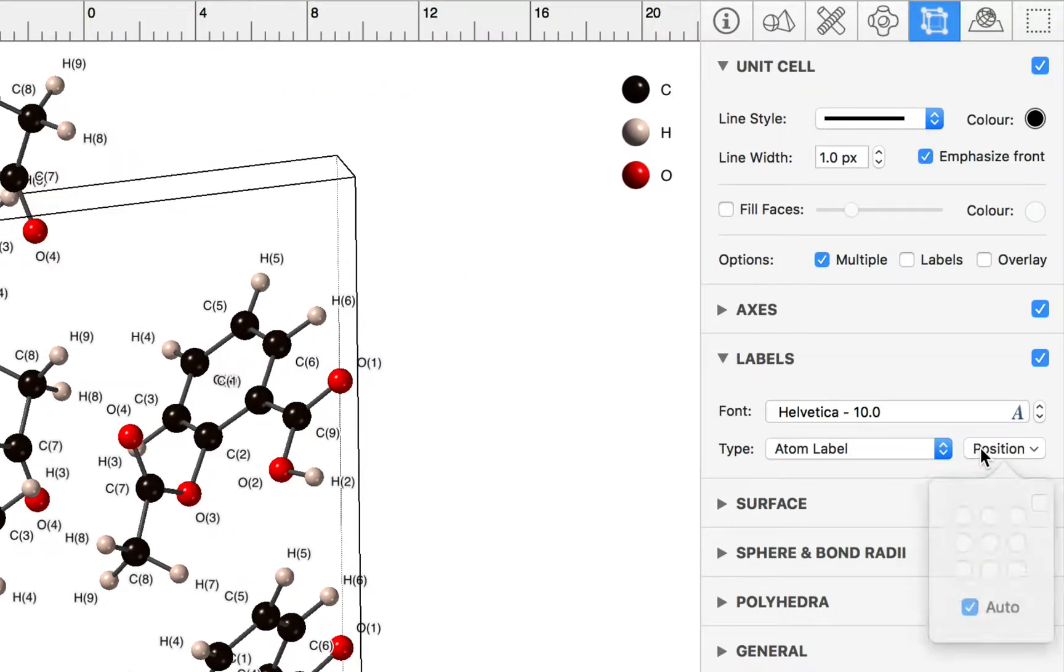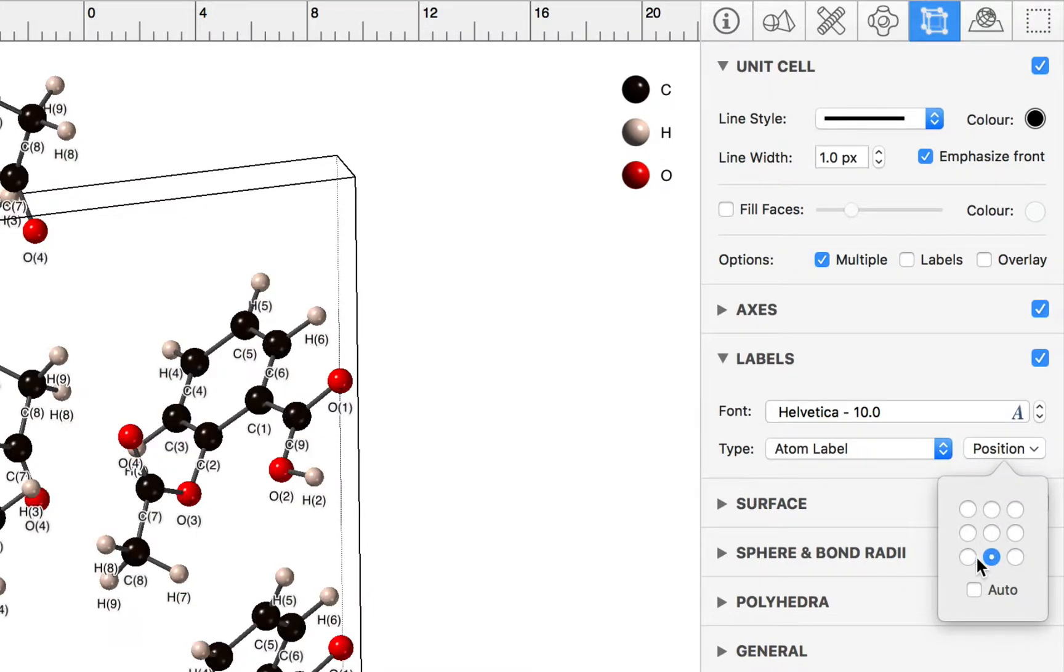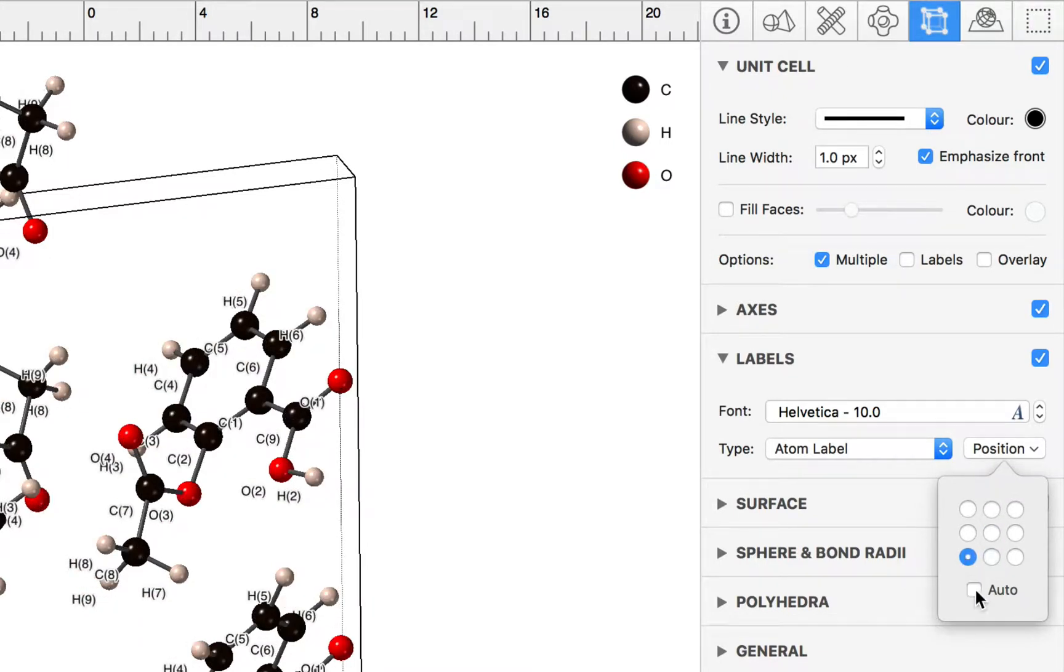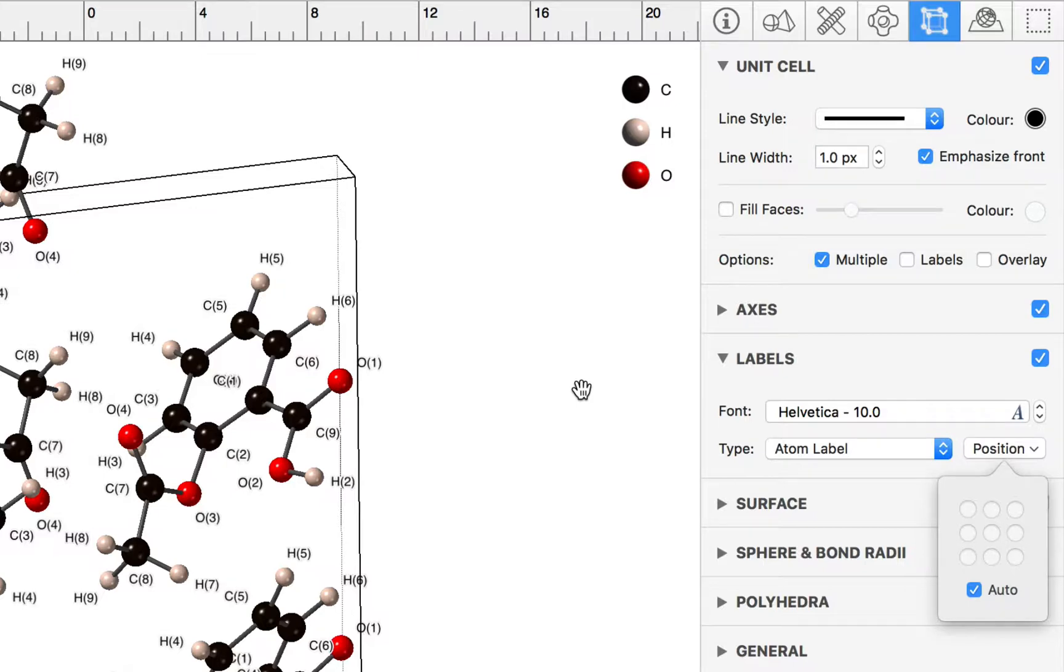You can click on the position popover and you can change that. We can reposition the labels in different parts of the plots, but the auto-labeling works pretty well most of the time.